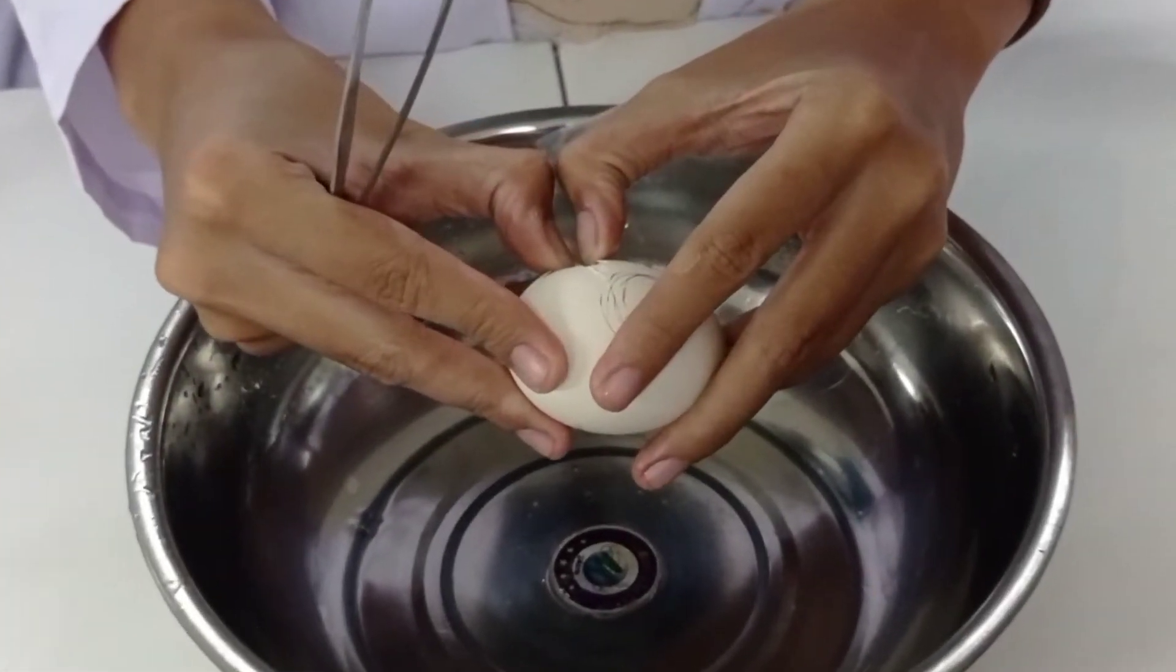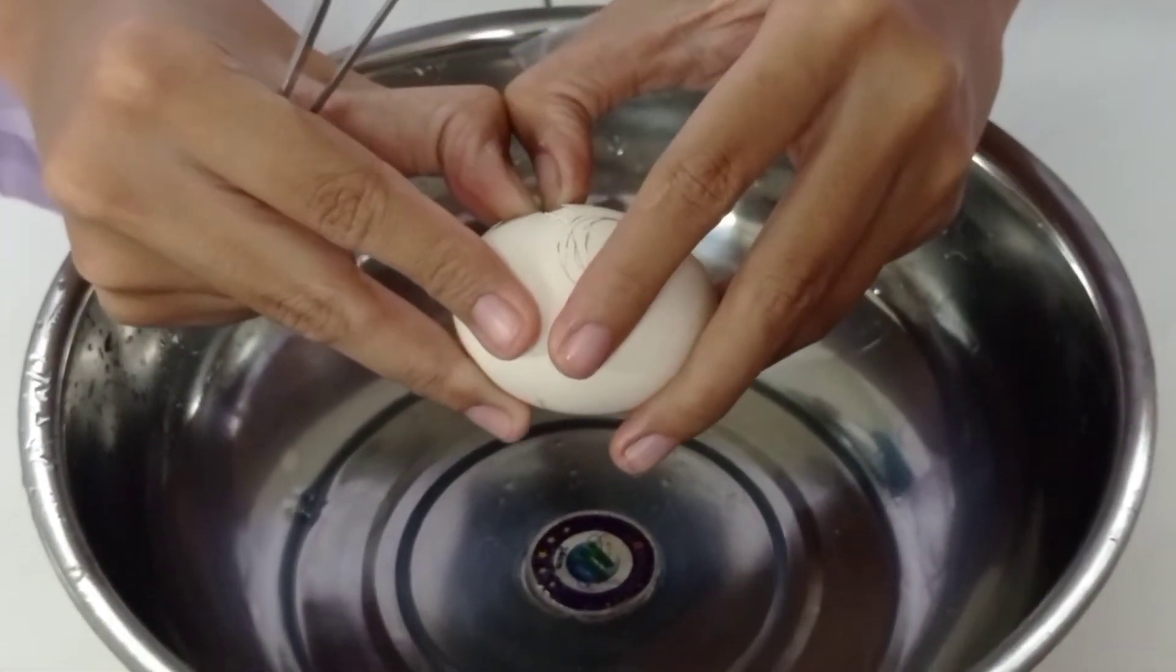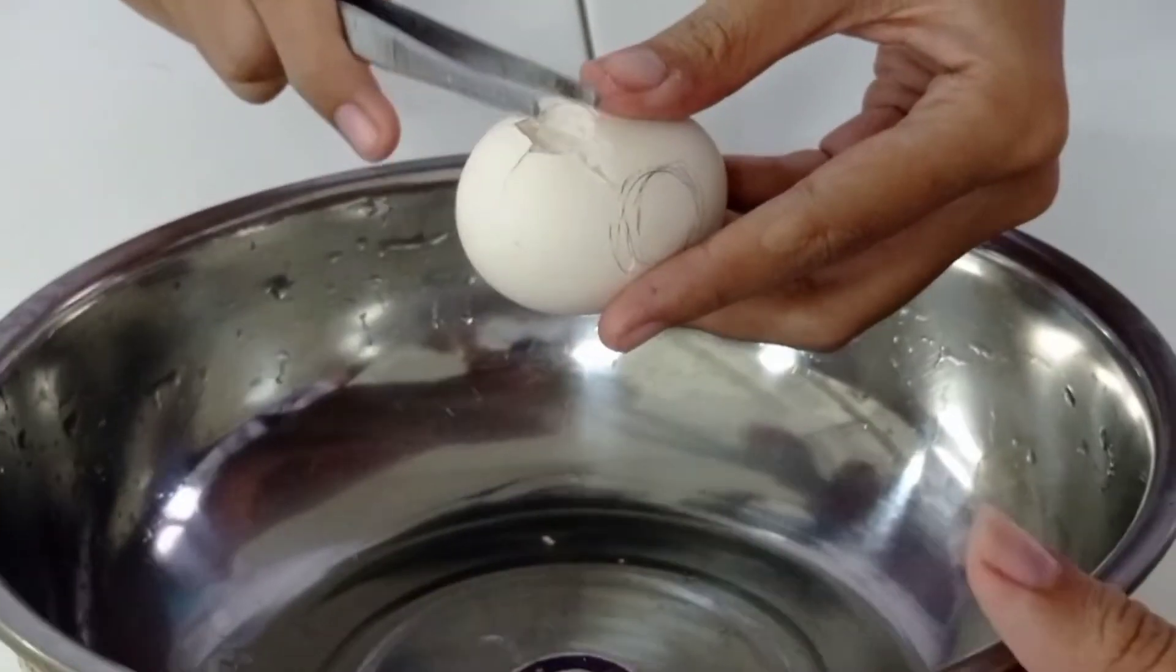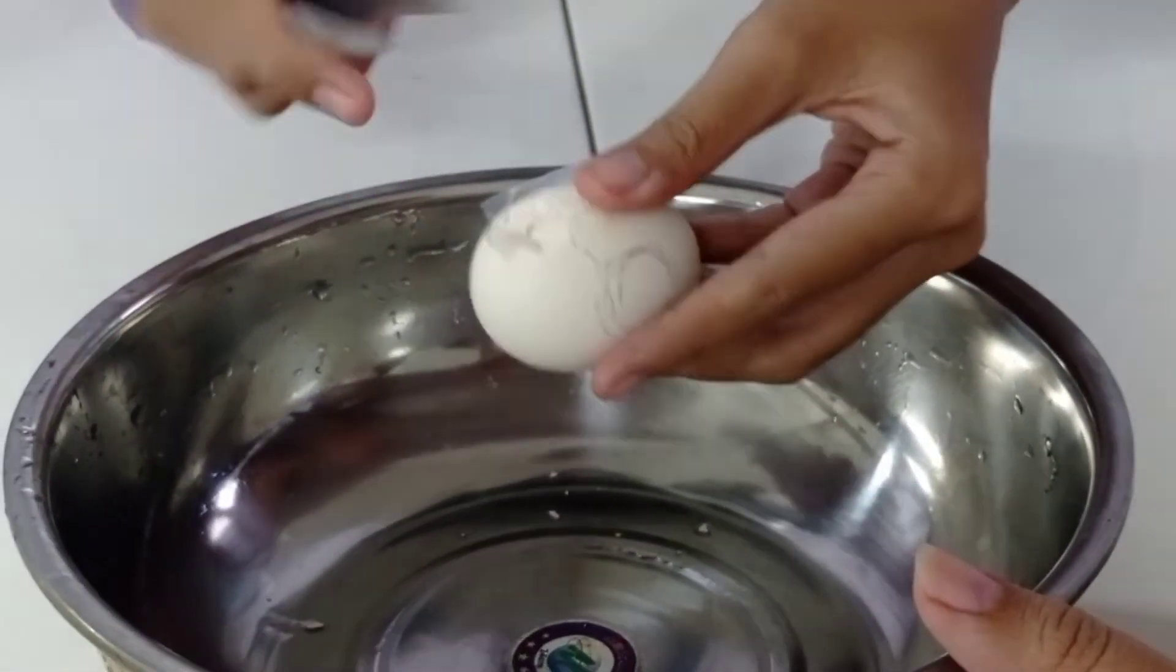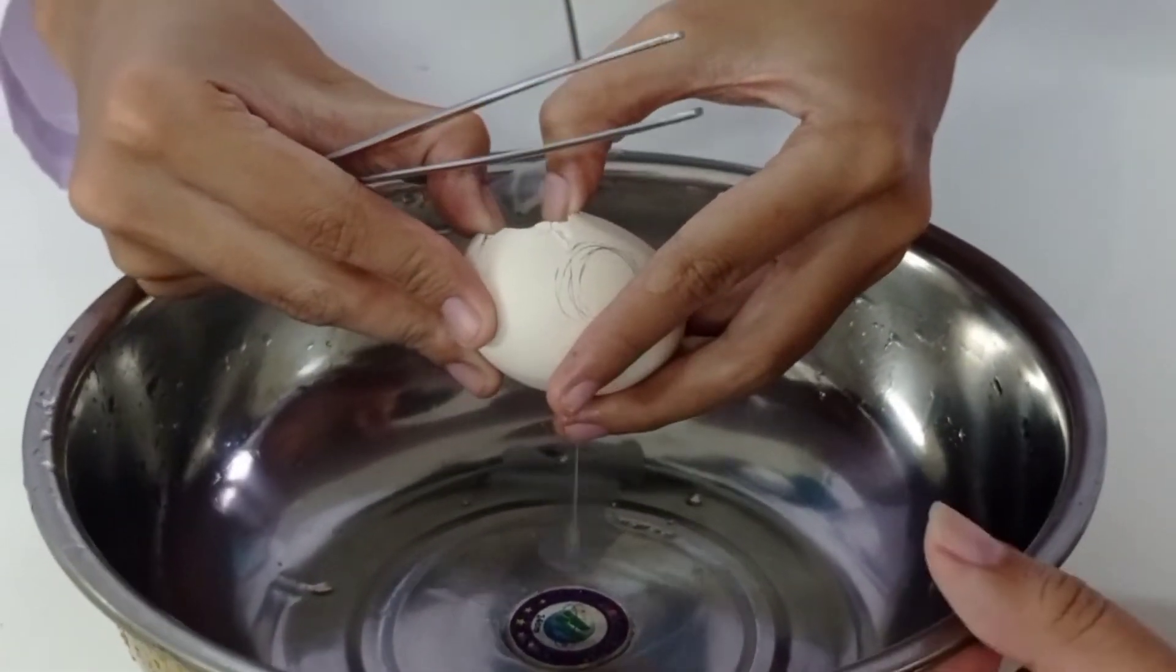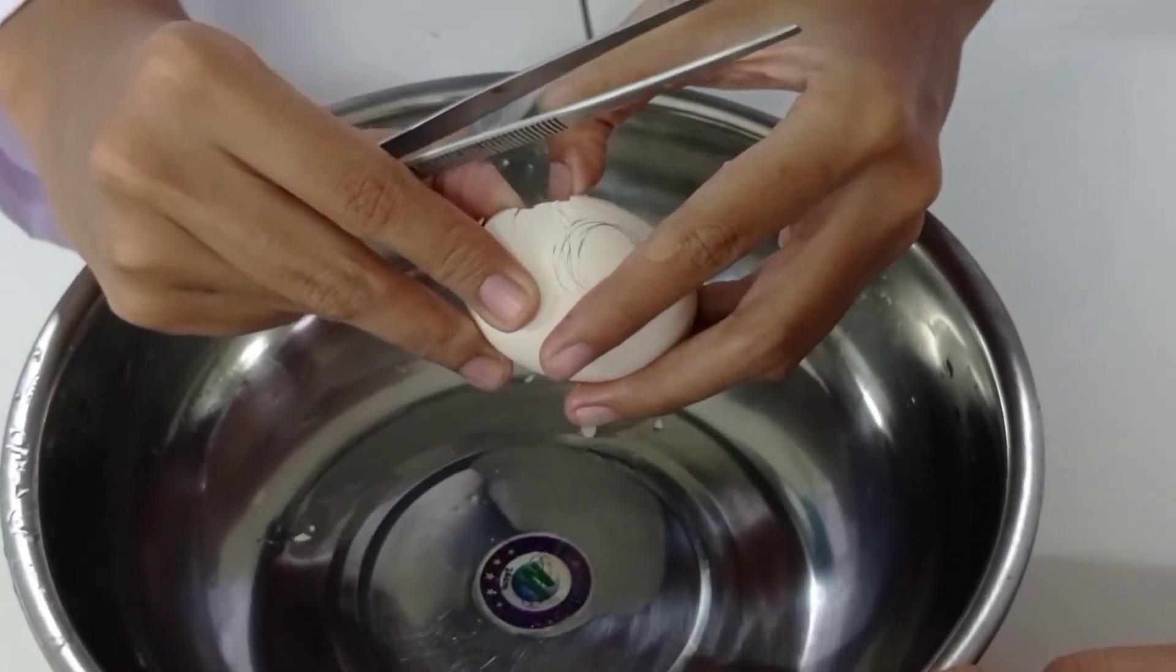Langkah ketiga, yaitu memecahkan telur. Ada dua cara, yaitu dengan cara memecahkan telur seperti menceplok biasa dan langsung dituangkan ke dalam wadah atau baskom.